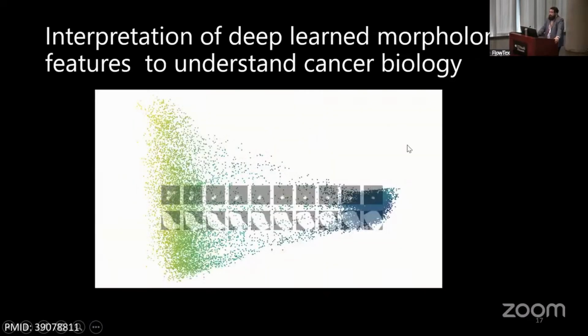So this is a paper that came out. It's looking at these wild type cells, and then it's a cancer mutation that's enriched in metastatic melanoma. The top row is light scattering, and the bottom row is the shape. And so as you move into this metastatic space, you're having increased epithelial shape and increased light scattering.